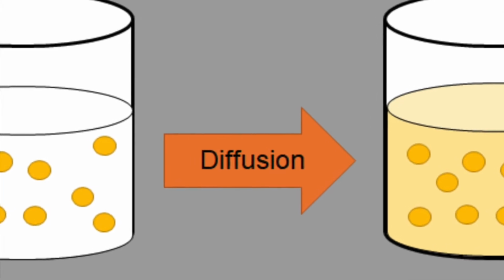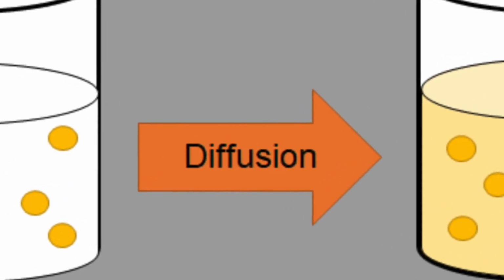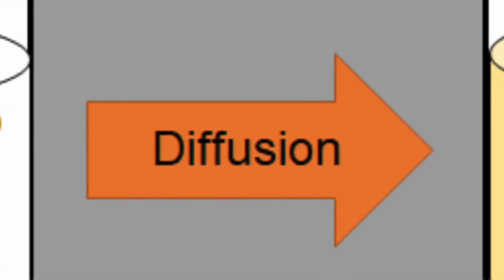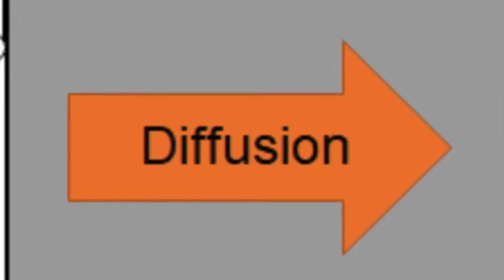The conditions we chose to vary for this experiment are the mixing speed, temperature, and bead size. By measuring the absorbance of the solution comprised of water with the tartrazine hydrogel beads over time, it is possible to determine the rate control mechanism constant and the fraction of dye release.